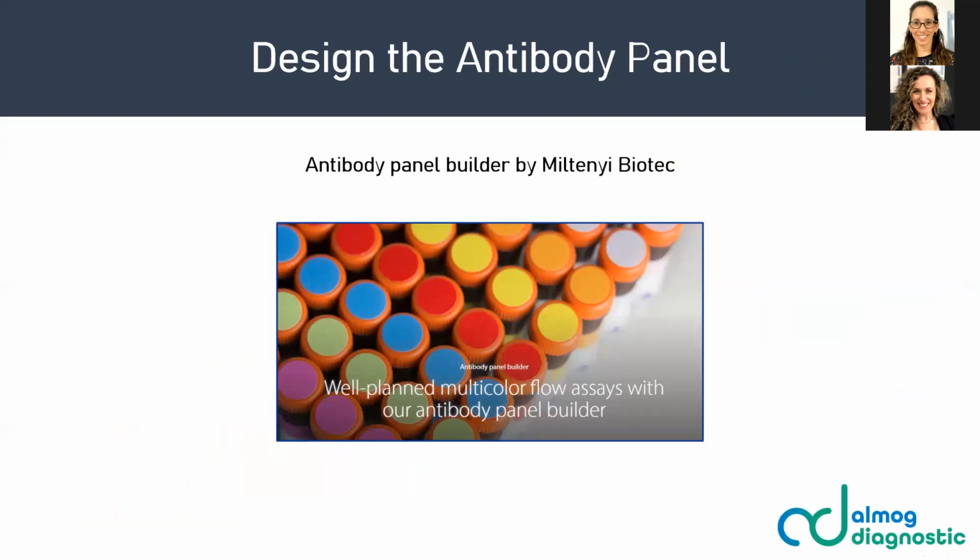So now we have come to the part of designing the antibody panel. I will enter Miltenyi's website, just as an example, to show you how the antibody panel builders work. There are many platforms available today. There is, let's say, FluoroFinder. FluoroFinder summarizes most of the antibodies offered by most of the antibody producing companies. So you can, of course, use the FluoroFinder platform. But here, for example, I will show you Miltenyi's panel builder.